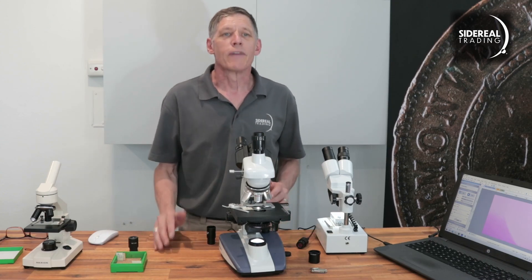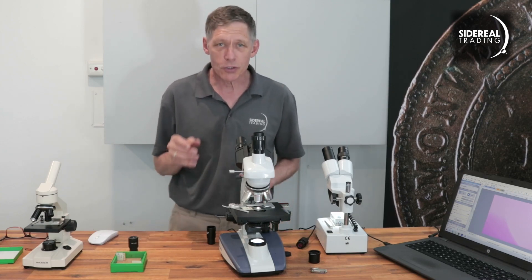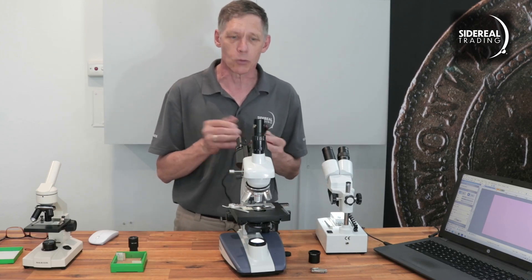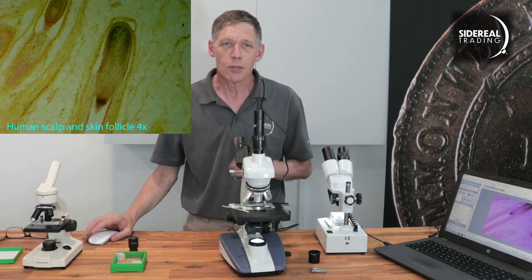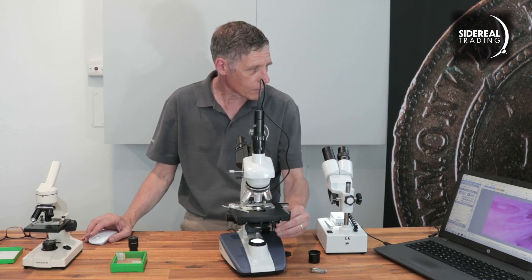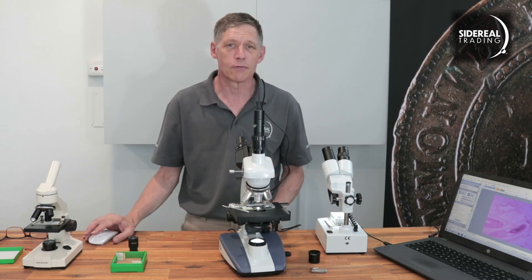Sticking with the biological microscopes, this one is a more advanced model and it's got a trinocular head. This means you can use the eyepieces while the camera is going as well — a great way to make a presentation or demonstration to a class for teaching. To get the camera into the trinocular there's an adapter, which allows you to focus both the camera and the eyepieces at the same time. The diameter of the trinocular and the adapter are all the standard 23.2 millimeters, so we don't need any other adapter. You might need to adjust the beam splitter on the trinocular — on this microscope you have to pull the lever outwards so light gets to the camera. You can then move the specimen around and focus it, making video adjustments as before.